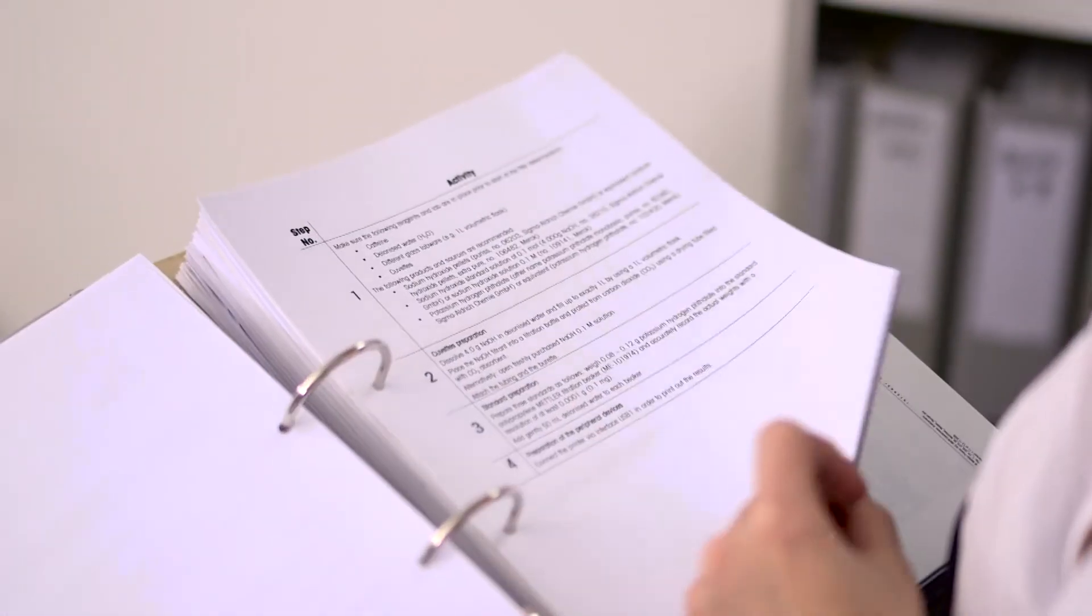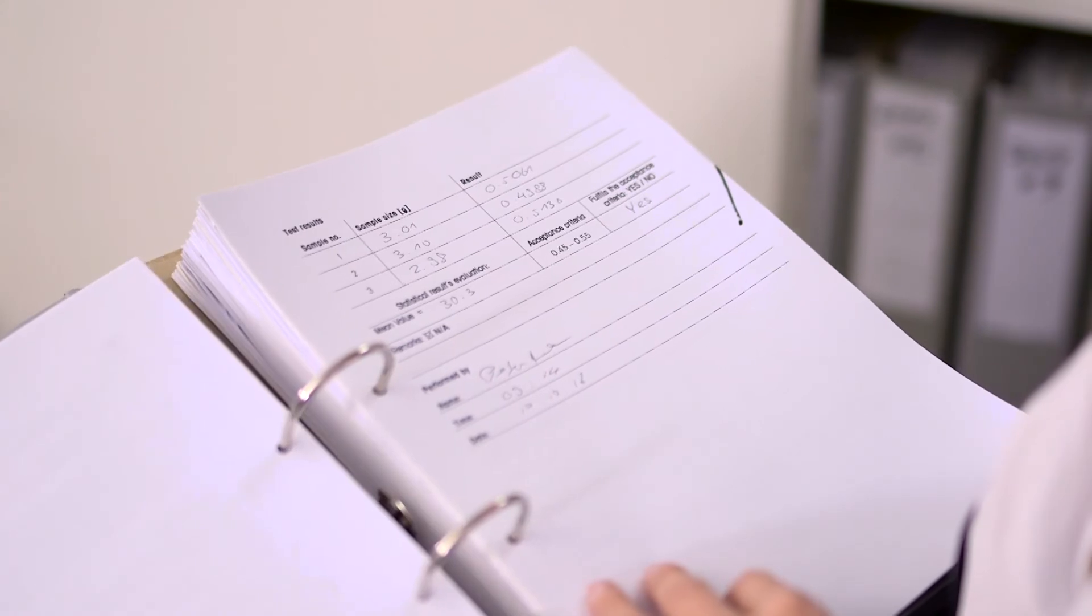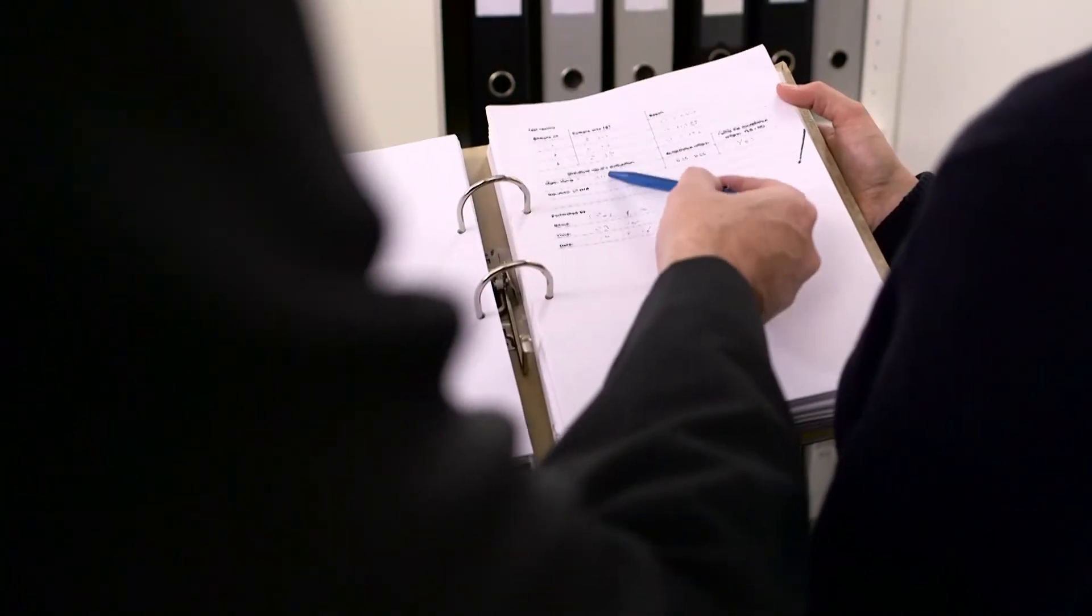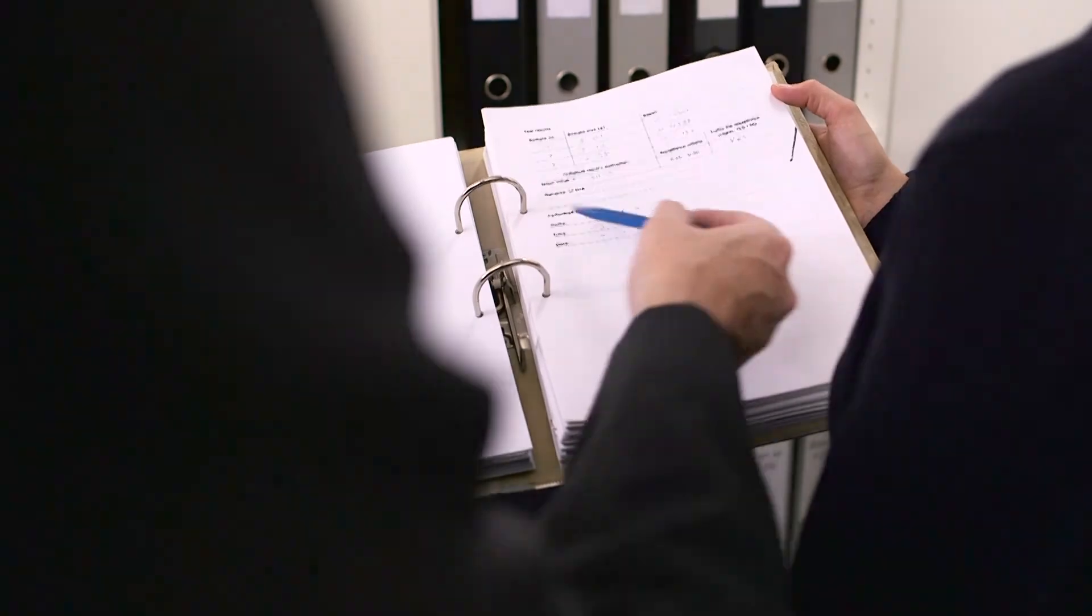The failure of user guidance and controls to ensure following the SOP as well as data management procedures shows up in the end product.